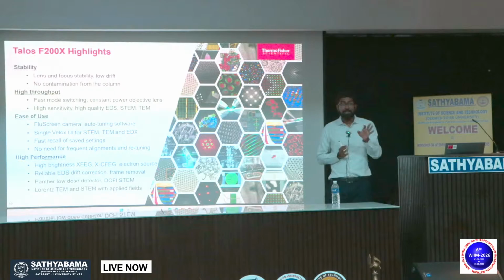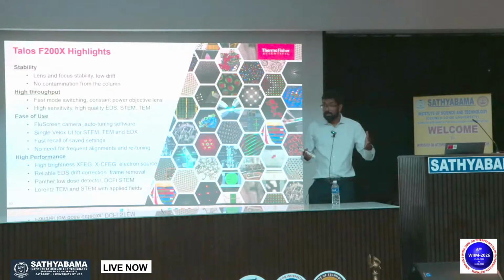The other day we tried it for fun with students. I asked ChatGPT to interpret the image. One time it didn't know what to do. I put in an image and said, please interpret this image according to diffraction pattern or composition, whatever. It did something, but with a lot of English and problems; some words are correct, some words are very wrong.